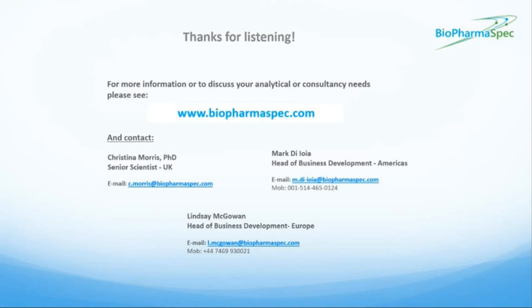So the cons, I would say, for the technique probably include the fact that it requires skilled operators with good experience to perform the analyses and also to interpret the data. And for label-free quantitation methods, the HCP detection is dependent on the ionization capability of the protein fragments, and that was something that I mentioned earlier as well, which is a downside, but it's why people switch and use the more accurate labeling methods for MS.